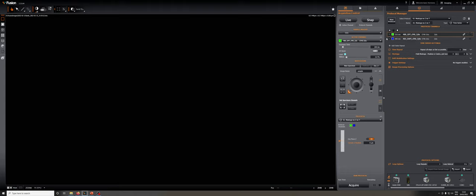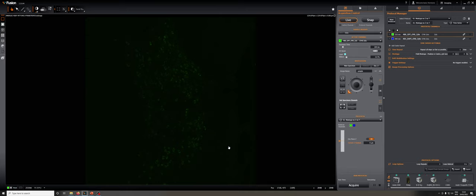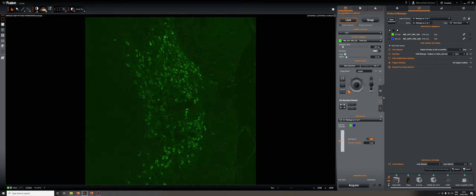You can see that whichever channel is currently active is shown here, and if I click on live, this panel will show me an image of what I'm looking at. If you want to adjust the contrast, you can try clicking here for automatic adjustment.